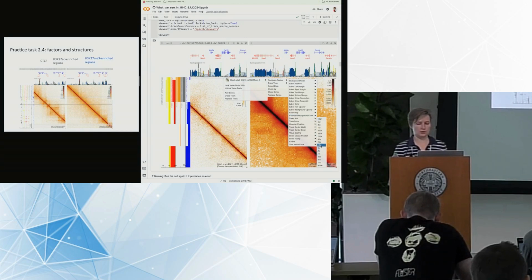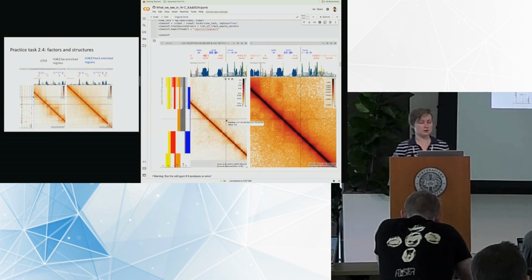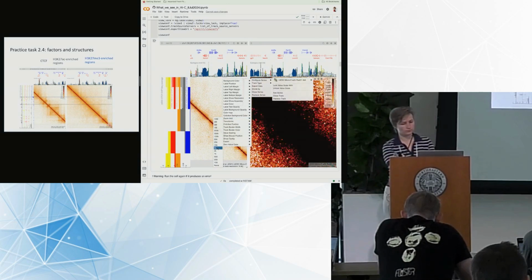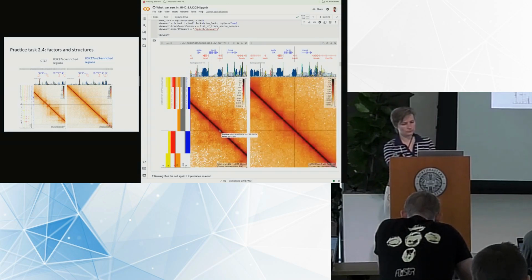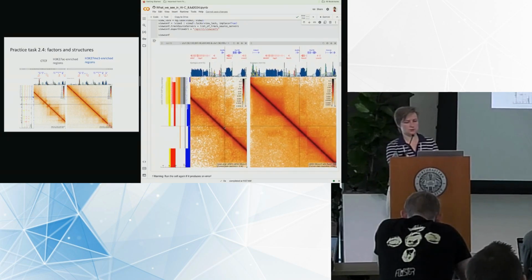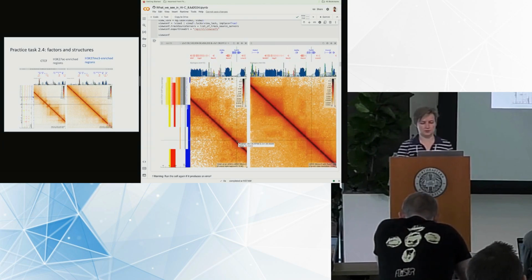For example, I would like to analyze it at 5 kb, which is much more reasonable to see loop extrusion features, and it won't be that sparse. And I do the same for the view on the right. Here it goes. And now you can see that it's much easier to analyze these views, see the features, etc.